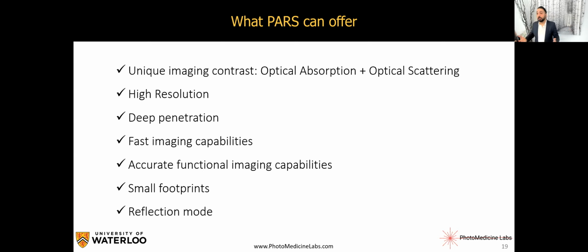We can do real time, as you saw, because we do not worry about the time of flight of ultrasound, since the speed of sound is much slower than the speed of light. Usually the speed of general photoacoustic systems needs to be limited based on the sound propagation.